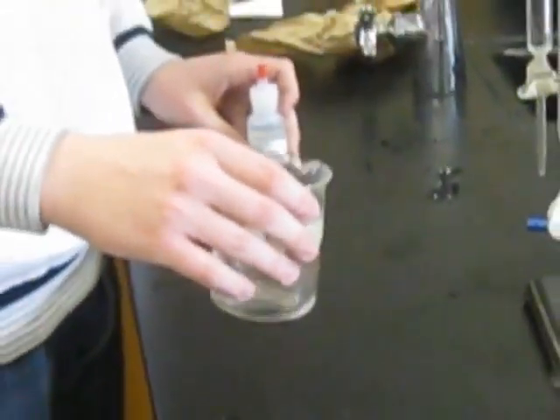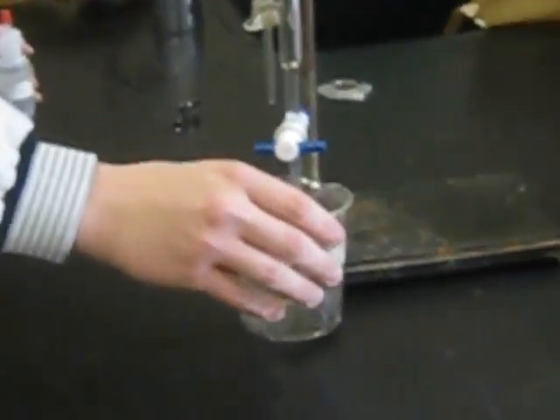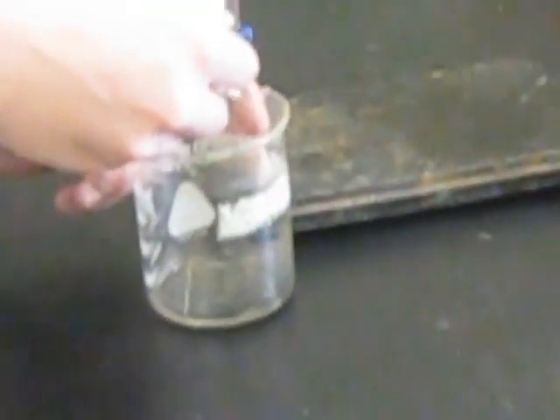And after he's added that, we'll go ahead and move the beaker over to the base underneath, excuse me, and we'll slowly add in base until the color begins to change, and he'll swirl the beaker as he does that to mix it properly.